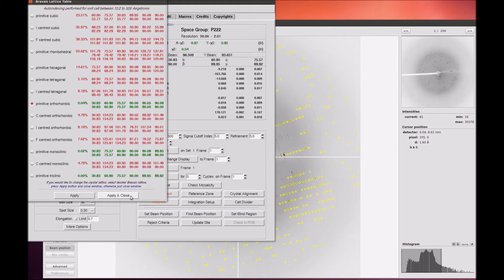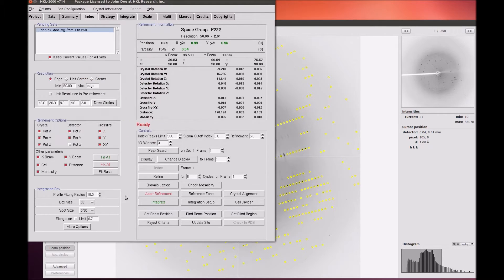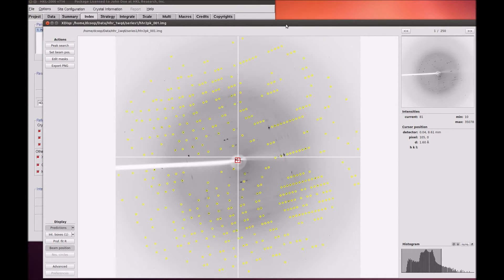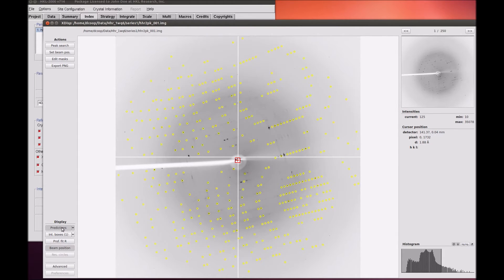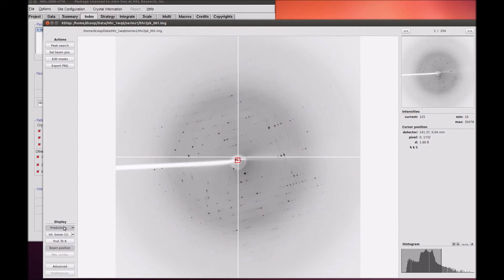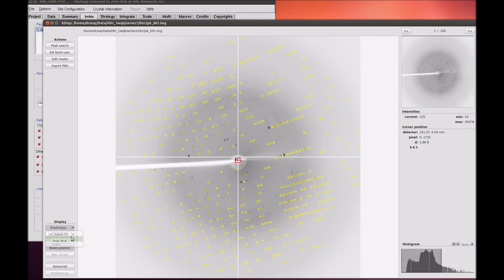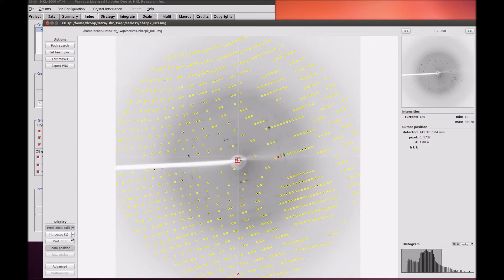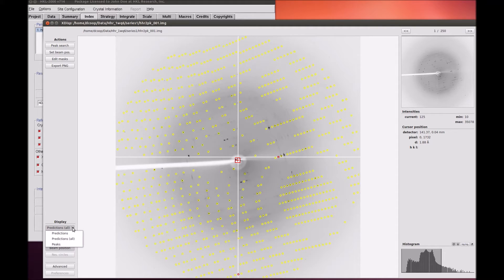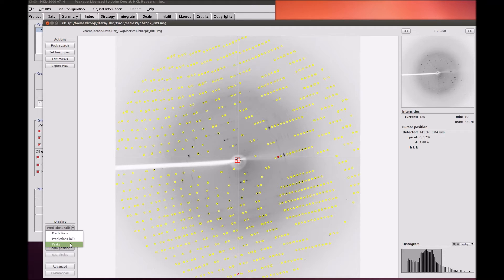Returning to XDispQT, you can toggle the predicted reflections on and off using the Predictions button. The arrow next to the button is a drop-down list that controls which reflections are displayed. The default is to show reflections that meet the sigma cutoff level you have set for refinement. By selecting all peaks, you can see how many predicted reflections do not meet this cutoff. You can also display the peaks found during the peak search again.